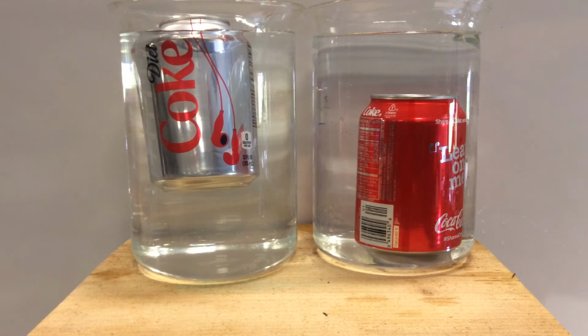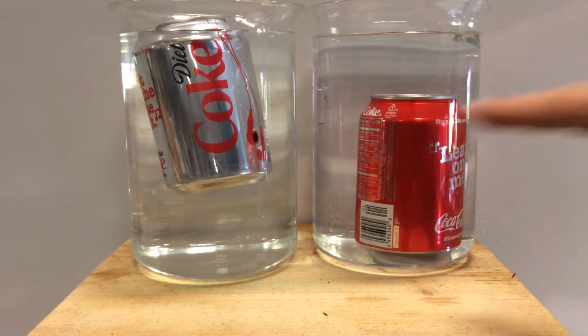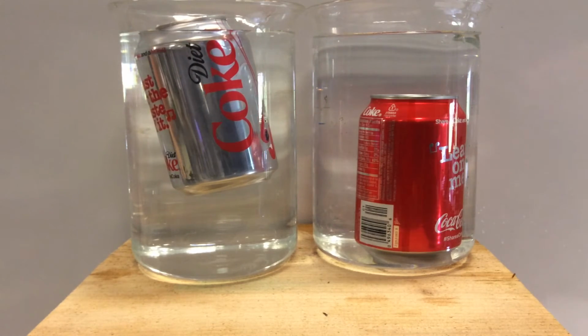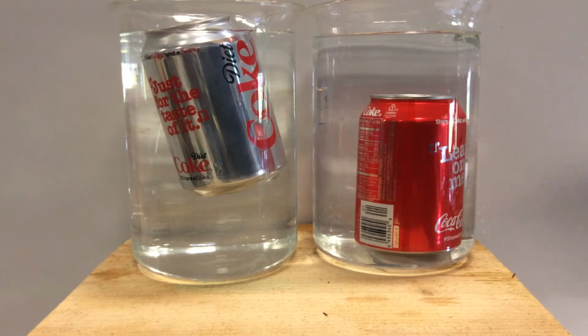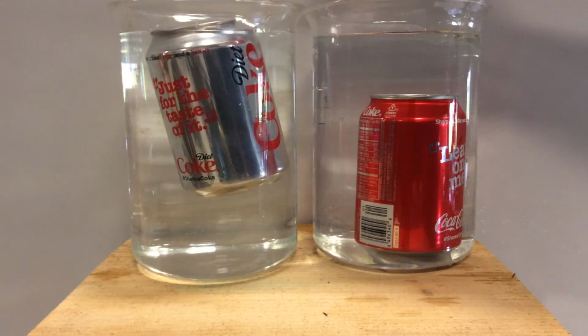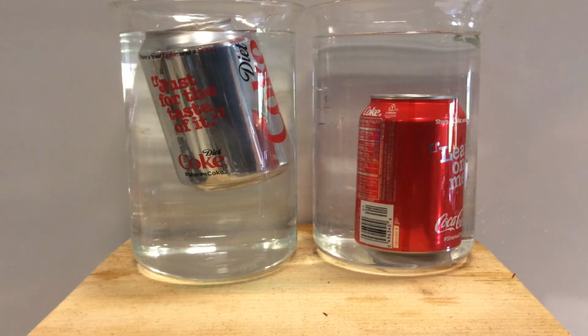That's an important observation. But the premise behind this lab, which we're going to test, is that the difference between these densities is that this has sugar and this doesn't. So we're going to say that the Diet Coke has the same ingredients as the regular Coke minus the sugar.